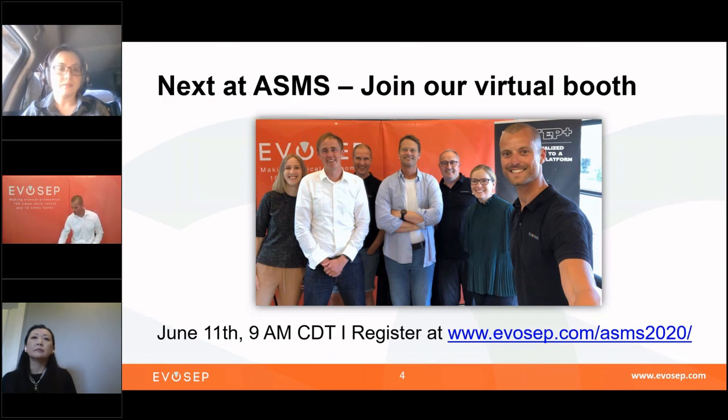And then I have a question for Agilent, so that's for you, Linfeng. How did you prevent drying out of the Evotips during the 4 degree stability test? Okay, so actually I put a liquid in the plate, the sample Evotip plate. So the top of the tip actually soaks in the buffer A, the LC buffer A. So they did not dry out through these almost 2 weeks of experiments.